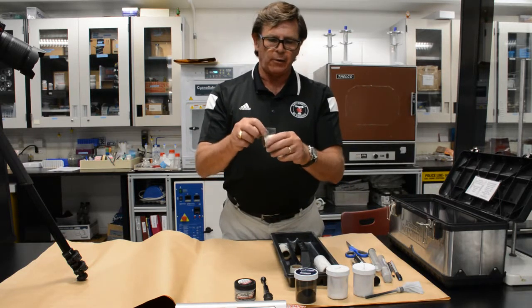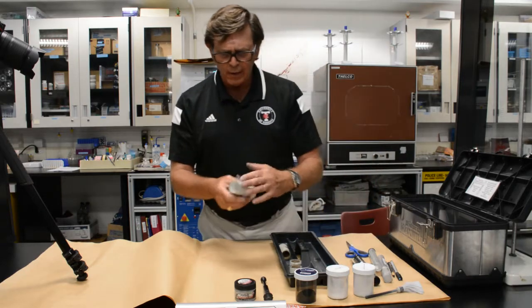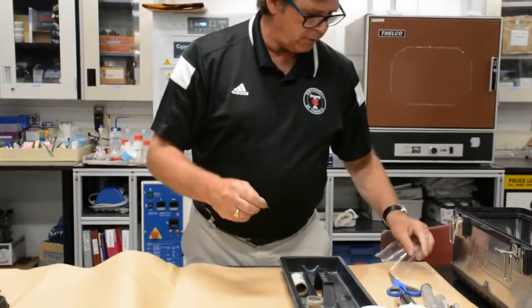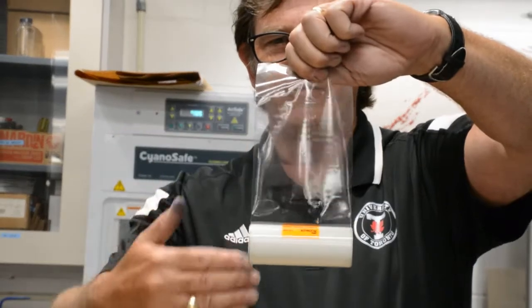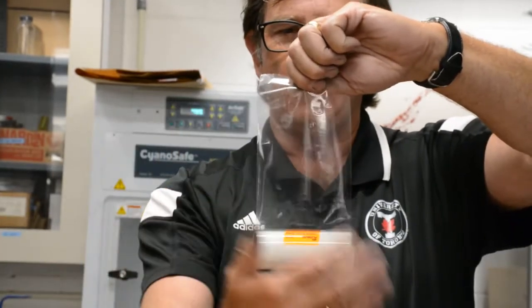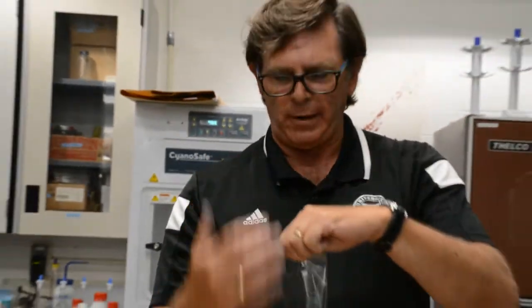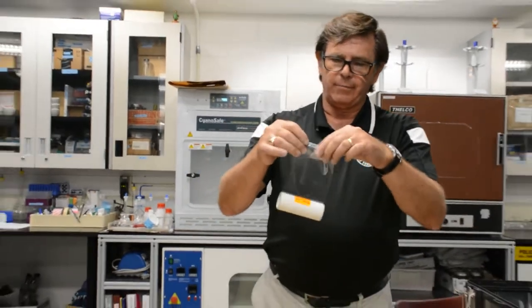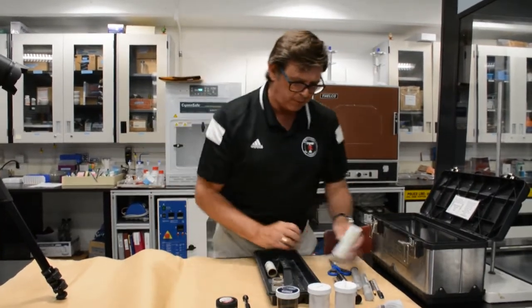It is available in a clear tape such as this, or else you can also get it in a frosted appearance as well. I'll just tear off the initial section here so you get a better view of this. You can see how crystal clear and uniformly applied the glue is on the surface. It is not like gift tape or packing tape, where you would see squiggly lines of unevenly applied adhesive on the underside of the tape. This is how it was explained to me as to why this tape is so expensive, because it has that ability, or that aspect, where it is completely clear and unobstructed. So I'll set that aside.